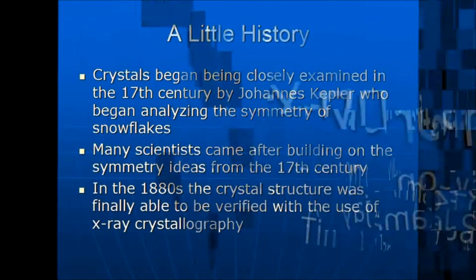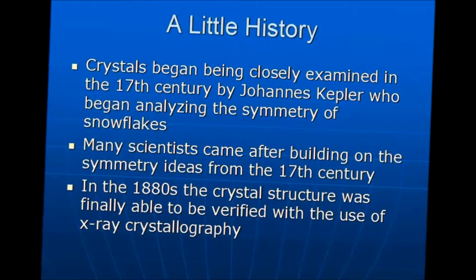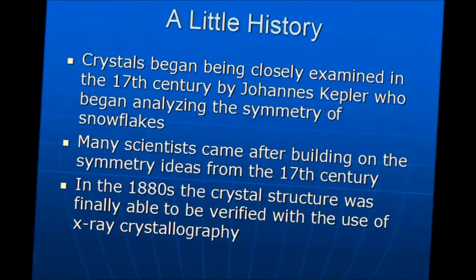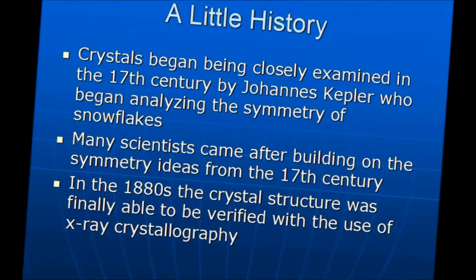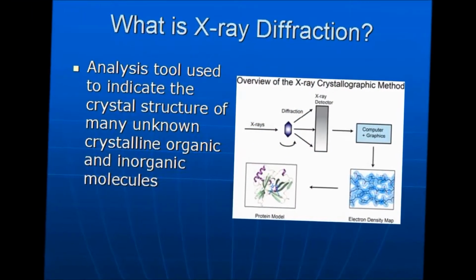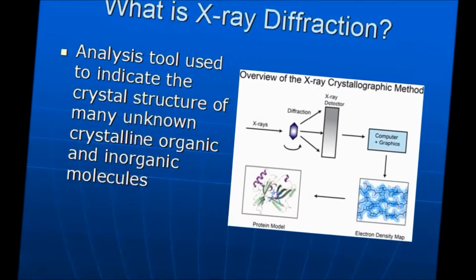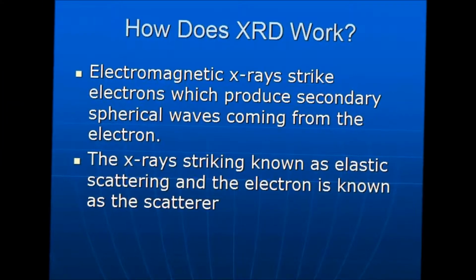X-ray diffraction. Crystals began being closely examined in the 17th century. Many scientists came after. In the 1880s, the crystal structure was finally able to be verified with the use of X-ray crystallography. What is X-ray diffraction? An analysis tool used to indicate the crystal structure of many unknown crystalline organic and inorganic molecules.